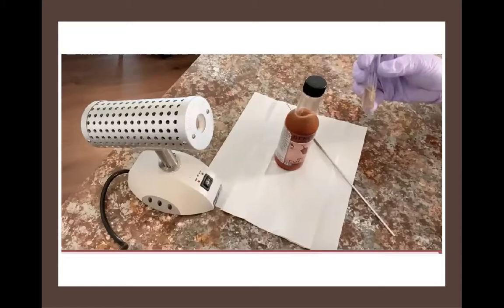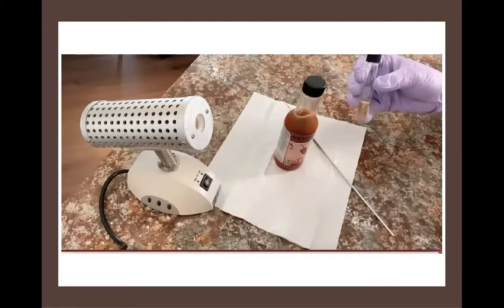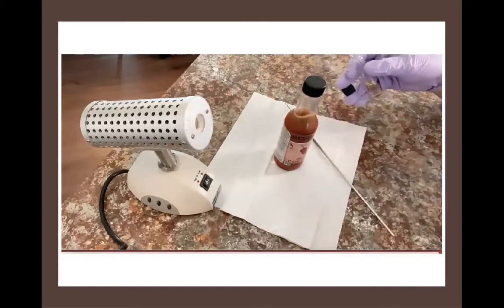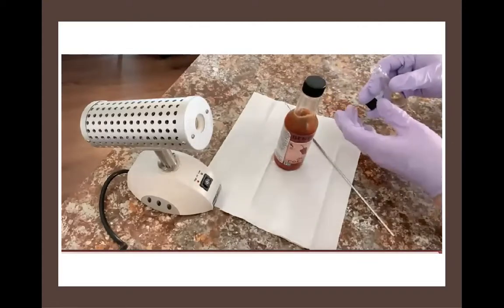The test tube I'm holding has a liquid broth nutrient media with bacterial cells growing in it. I'm going to take a sample of those cells out and flame the mouth of the tube before and after I remove them. I'll take the cap off and hold the tube at an angle — but here's the extra step: I'm going to pass the neck, the mouth of the tube, through that flame. The bottle of hot sauce is my Bunsen burner — pretend there's a flame coming out of that black cap. I take the neck, the open part of the test tube, and simply pass it through the flame.